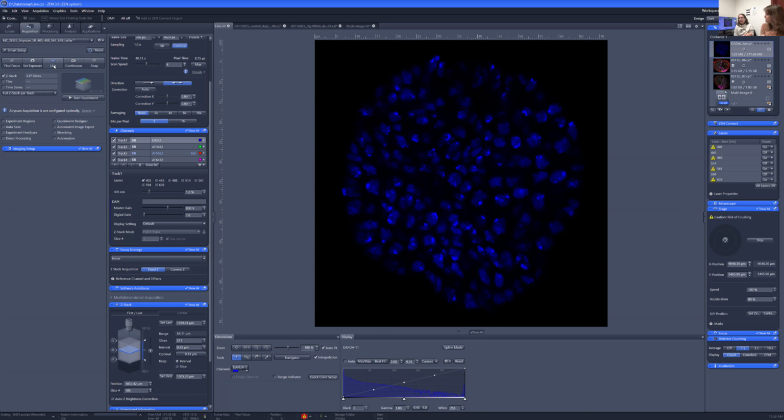In microscopy, we call this a Z-stack. If you think about moving around on coordinates in X and Y, that's changing where you are in a 2D plane, and Z is the third direction. So I'm imaging the same place in X and Y, but I'm imaging a stack through Z.